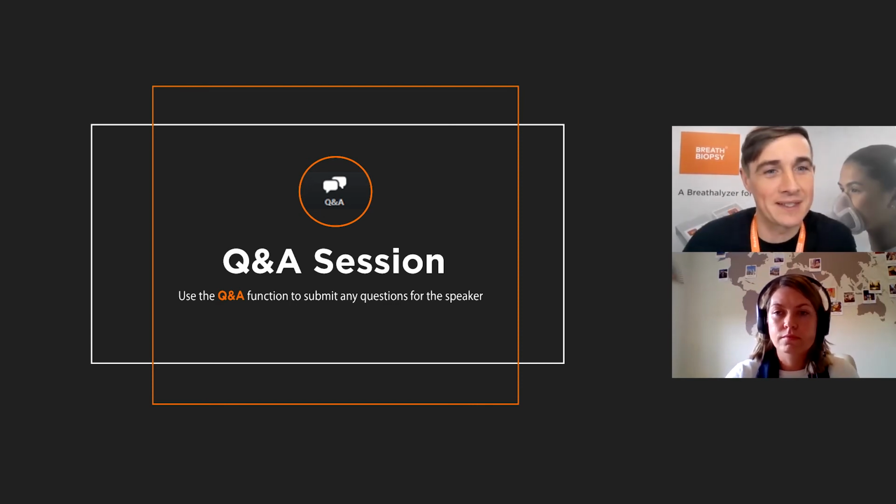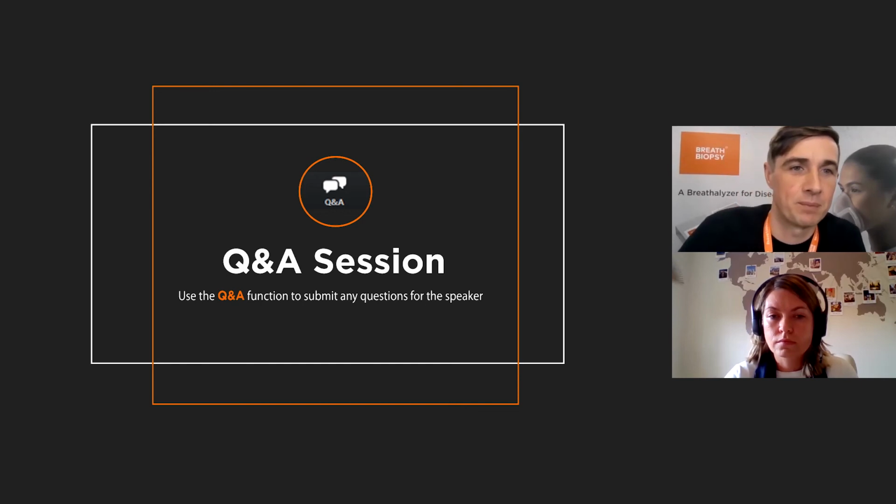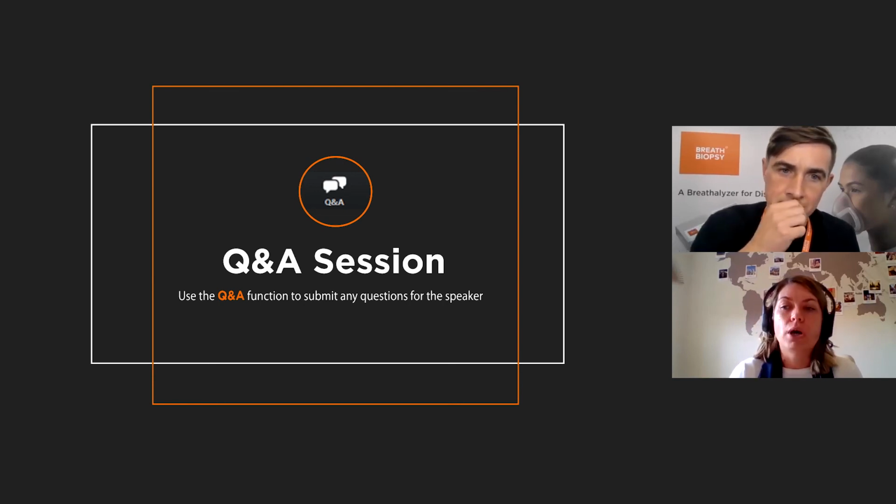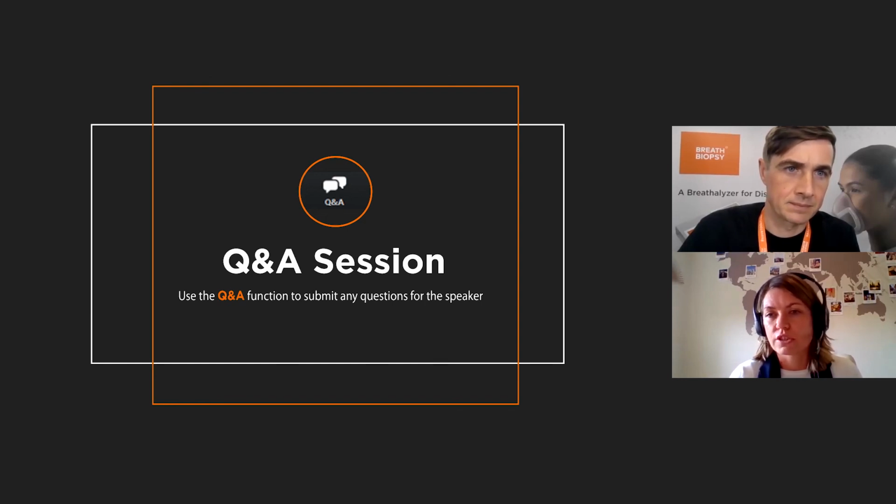A question here from Maddie. Can you normalize the data in this software, or would you need to export to another statistics platform? Yeah, so within the ChromCompare+ software, you can do normalization. We've included features like grand total or sum normalization, as well as probabilistic quotient normalization, which is used quite frequently in metabolomics studies now, and the traditional internal standard normalization as well. And there are extra transformation tools that you can use, like square root and log10. So we've tried to include a range of different options there. But if there are particular normalization techniques that you use already, you can export all of the data out as CSV. So if you're already using other stats packages, it can be exported as one CSV file, and then you could use any of those tools that you've already developed.